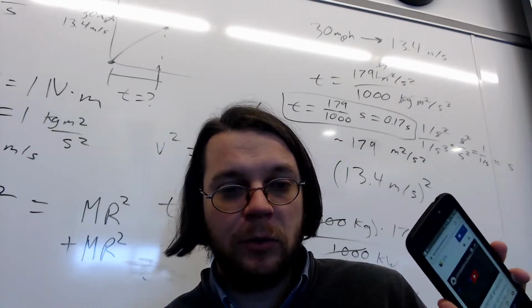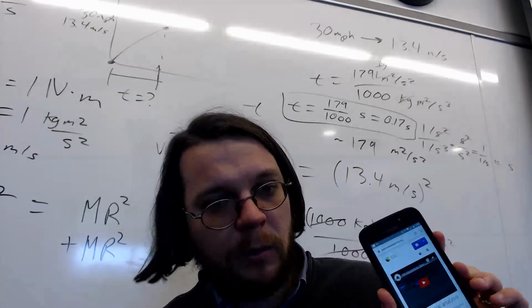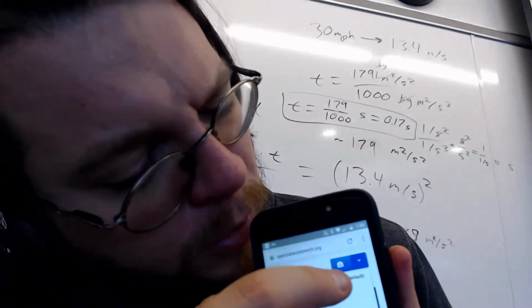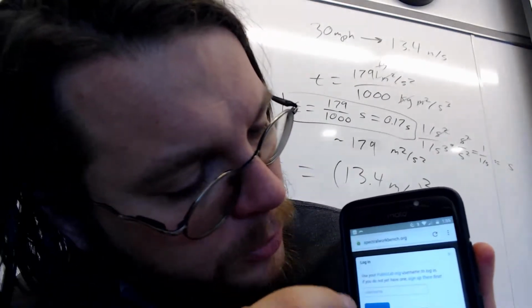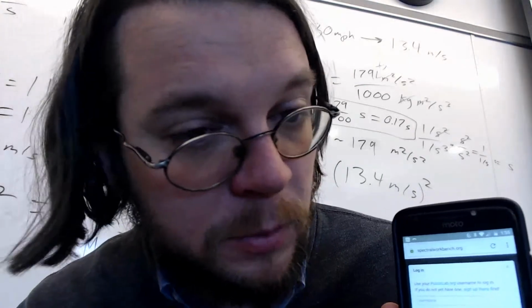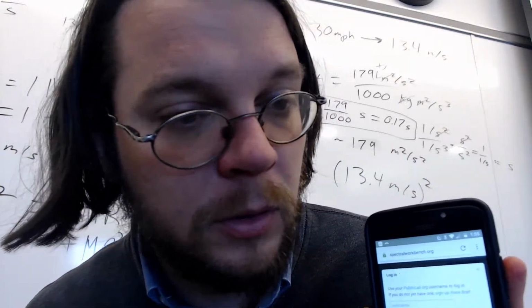So you want to go to spectralworkbench.org, which is the site that I'm on here, and in a minute we'll push this camera button to open up the interface. But what you want to do is click kind of here and go down to log in, and you need to have already created a profile with publiclab.org. The reason it's important to log in is because you want to be able to save your spectra to this website so you can analyze it on your laptop or iPad later.